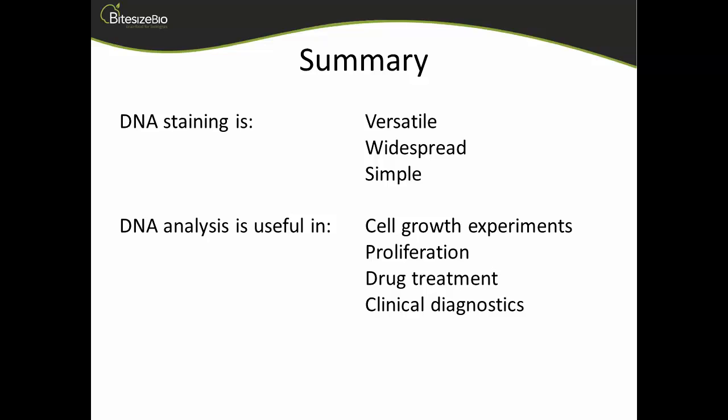Great. And the next question, Derek, just to clarify that forward and side scatter as well as single fluorescence is required for cell cycle analysis to exclude doublets. So I guess, do we use the forward and side scatter also to exclude our doublets? I would use as many things that I have at my disposal to exclude doublets. So as well as looking at the area and height of the DNA signal, which is a very specific signal, scatter's not as quantitative, it's a bit of a qualitative parameter on a flow cytometer, and so I tend not to use that as a primary gate. But we can also look at the area, the height and the width of our scatter parameters as well.